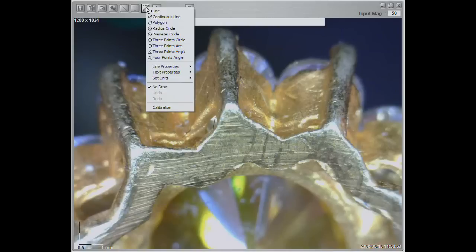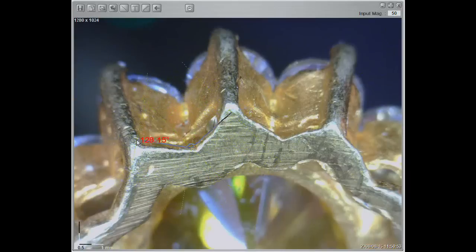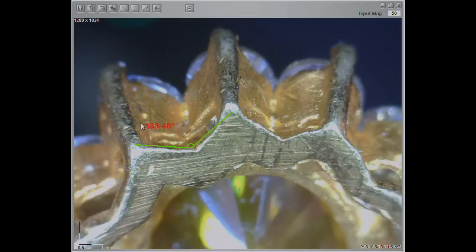Select three points angle to start measuring an angle. Start measuring from the pivot point, left click for the second reference point, then left click again for the third reference point. Finish by placing the results where you want.